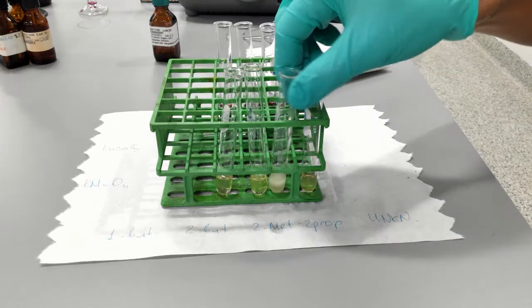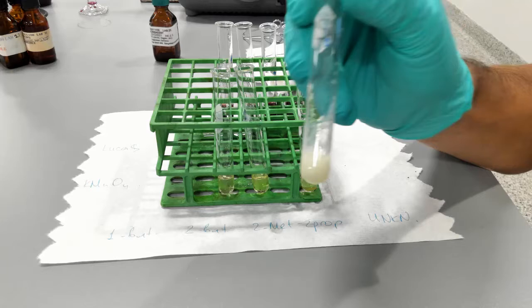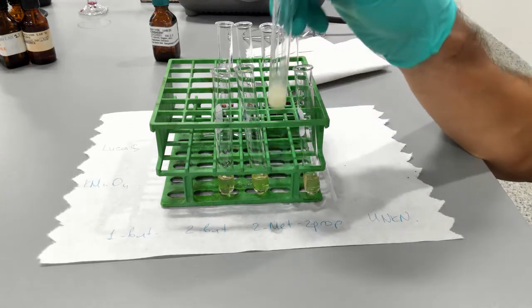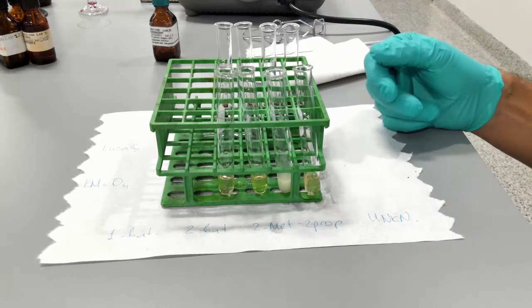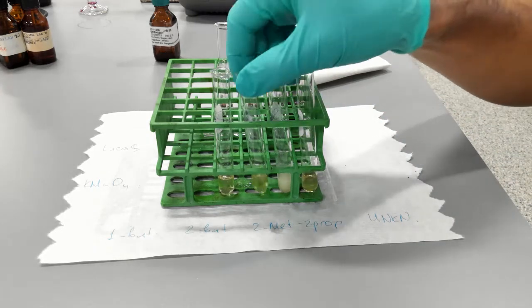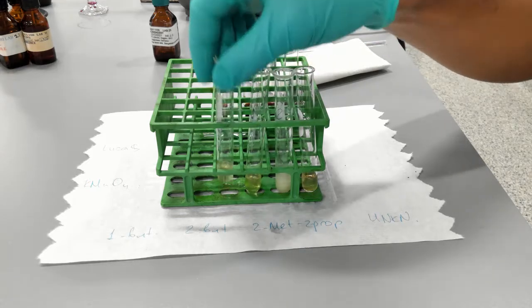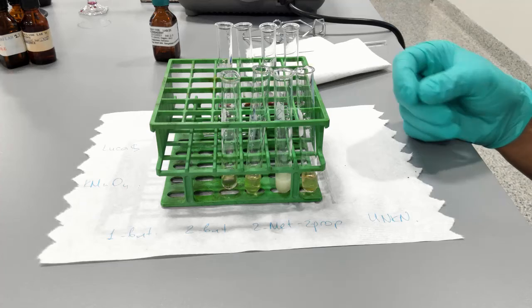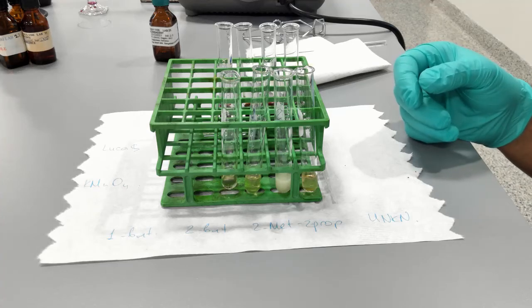So we can immediately see that in tube number 3 we see the cloudy appearance. So it's a tertiary alcohol, 2-methyl-2-propanol. Now we're going to wait some time, check for cloudiness again, and then heat the tubes that are clear for 15 minutes in a water bath.